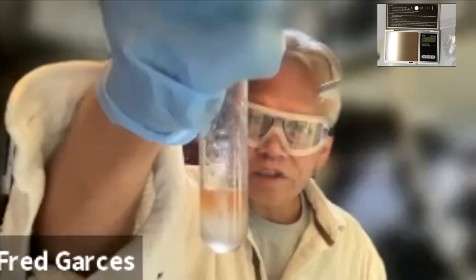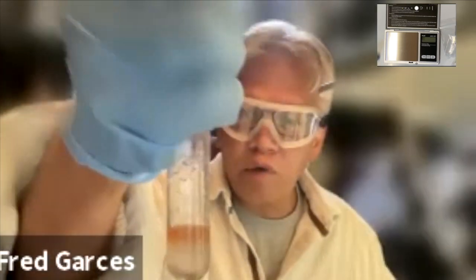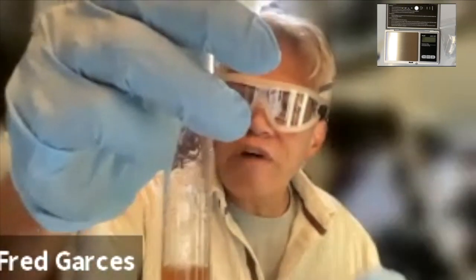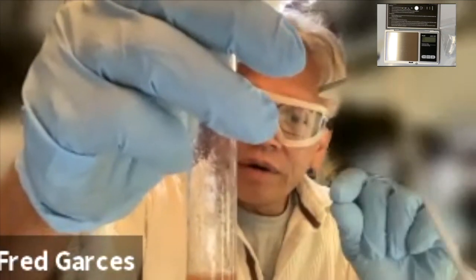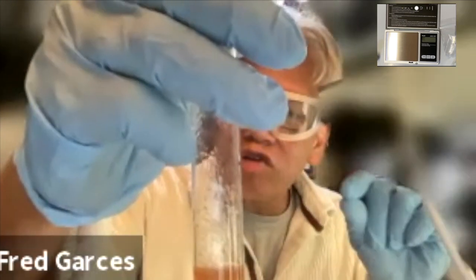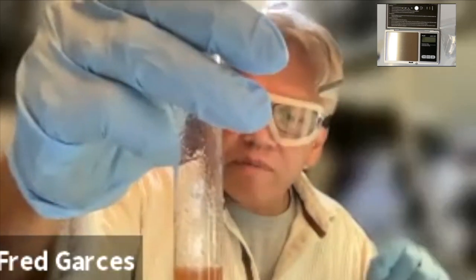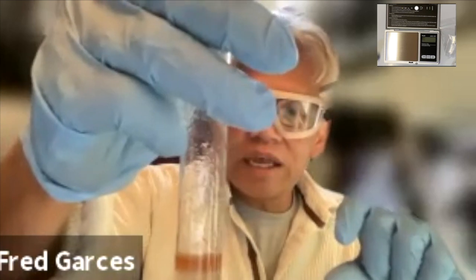Okay. So based on that, and then again, the way you determine which is liquid A, liquid B, and liquid C is use the size of the layer as an indication, because you use different volumes. If you use different volumes and they're distinct from each other, then you know that, oh, this layer is bigger.